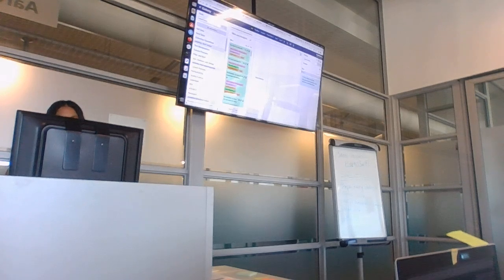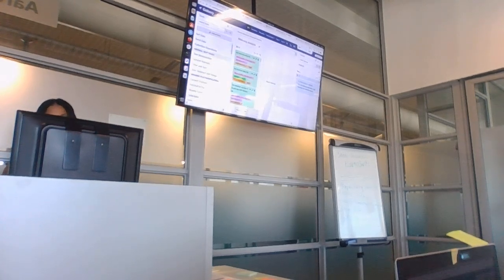What you can do is you can click on this little button. It's very small, but it says history options. If you click on that, you have the ability to show your different history side by side. It's actually the first option. It says show history side by side.